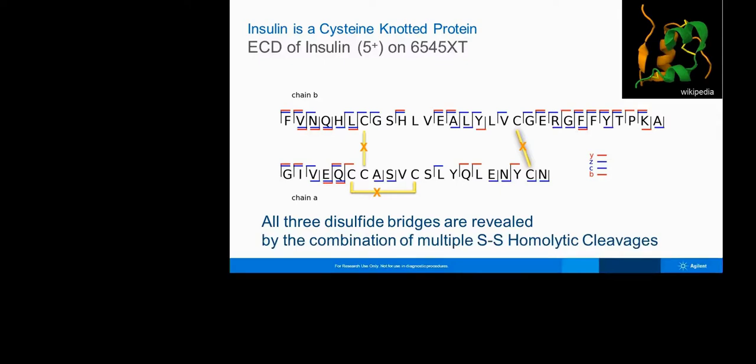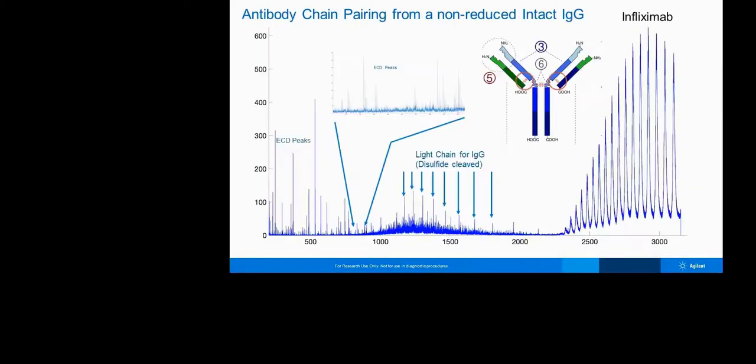we look for the B chain, and we consider the A chain as a post-translational modification. And we can get extensive fragmentation across the B chain, repeat the analysis, and you look for the A chain with the B chain is modified. And so we've got very strong evidence for this disulfide being present. And you repeat this process, but we then find evidence for all 3 disulfides and how they were localized. This works on much larger proteins as well.